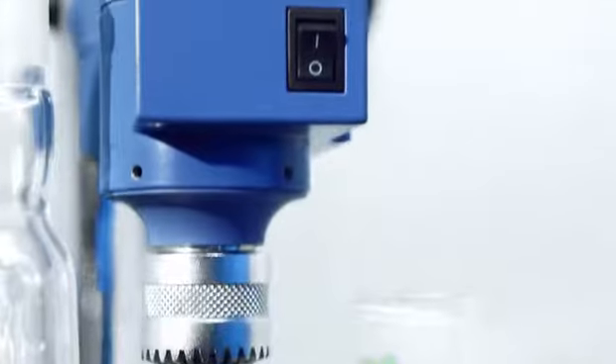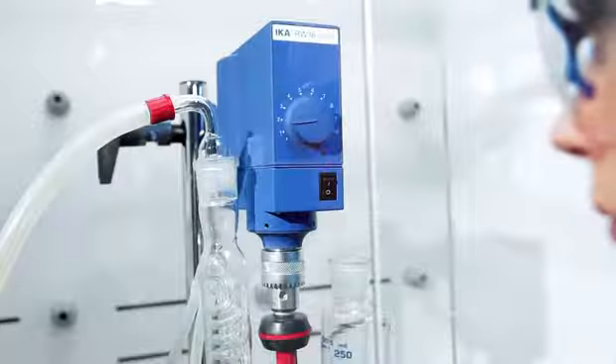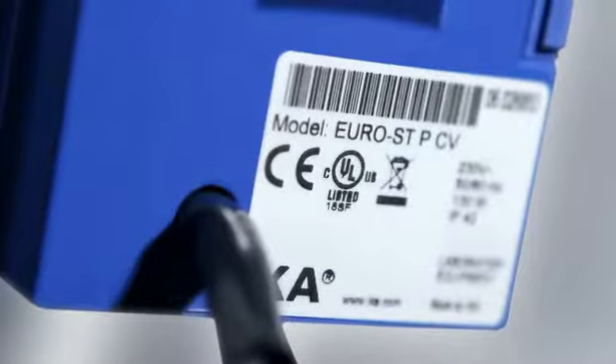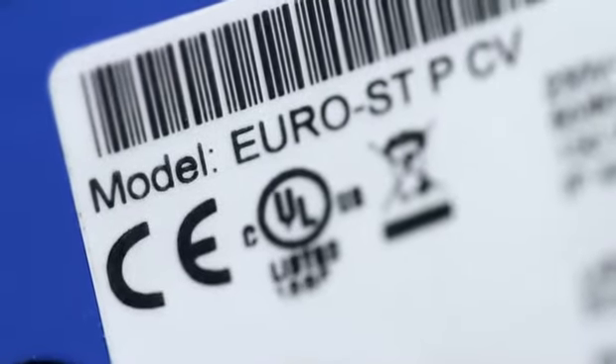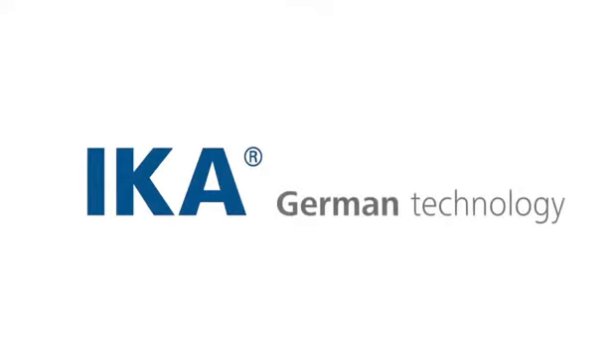All units are suitable to be operated for unlimited durations. Proven brand technology. Certified according to CULUS, CE and IEC. IKA — designed to work perfectly. German technology.